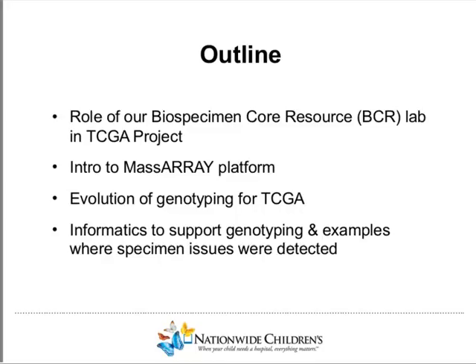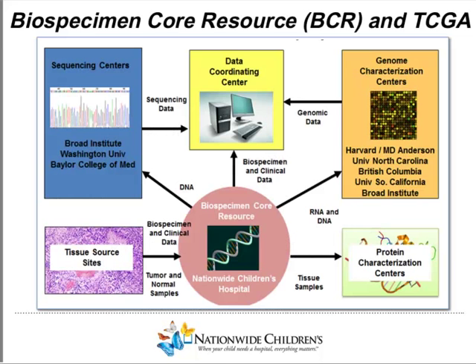And then lastly, I will move to some of the informatics tools that can and potentially, you could say, need to be developed when working with large genomic samples and a lot of genotyping data that's being generated from these. So with that, I'll jump into what our BCR is and what TCGA is as a larger project.